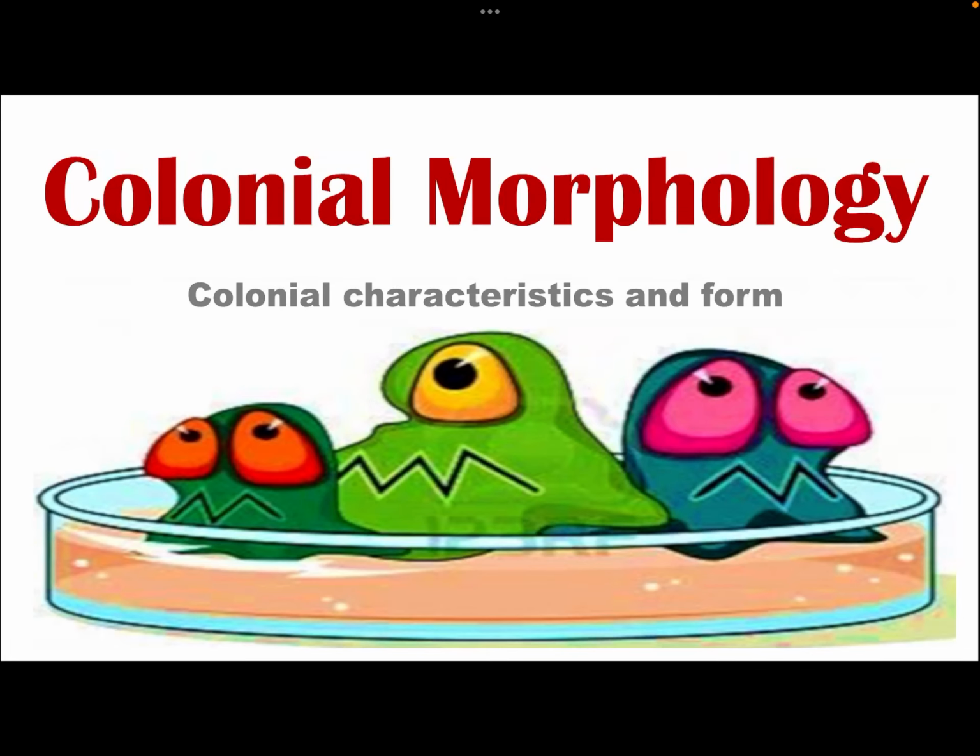So hello class, I will be discussing another topic which is related to bacteriology, also related to the previous topic that we have discussed, the isolation to pure culture. This time around we will be having the colonial morphology. That means we are to observe how the colonies would look like on an agar plate or even in a test tube agar, after we have isolated.